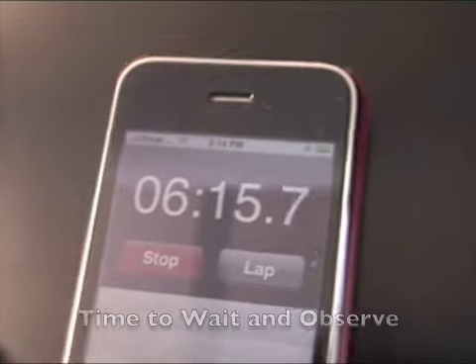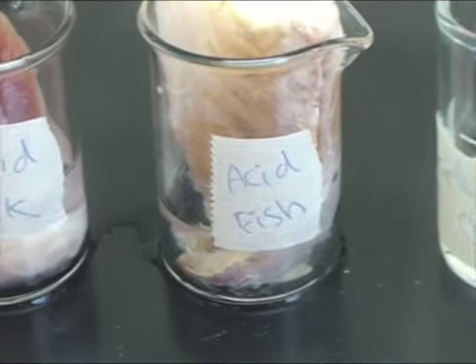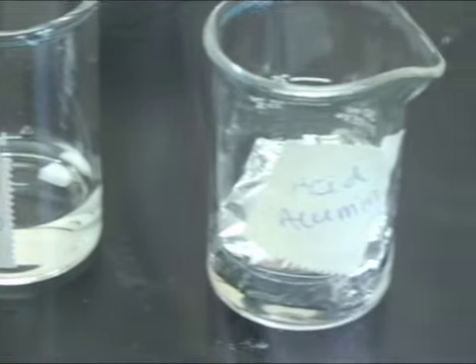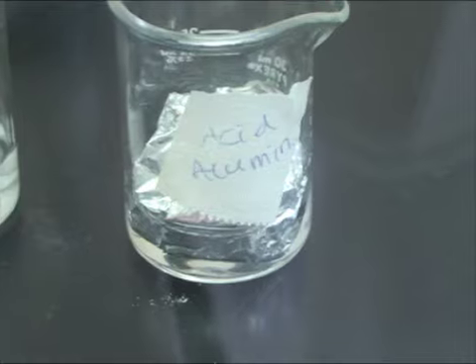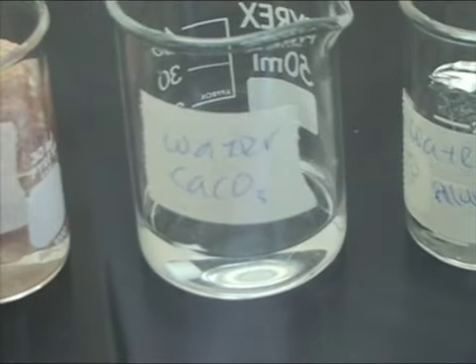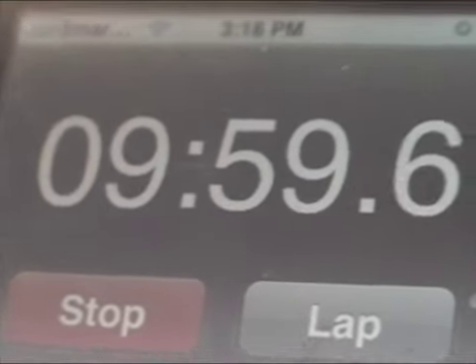After 6 minutes, our lab was running smoothly. The acid pork as well as the acid fish were both whiter. The acid limestone, or CaCO3, produced quite a few bubbles, and the acid aluminum was producing some bubbles as well. On the water side, no change was recorded in either the pork or the fish. In the water CaCO3, there were very few bubblings, and in the aluminum, there were no changes at all.